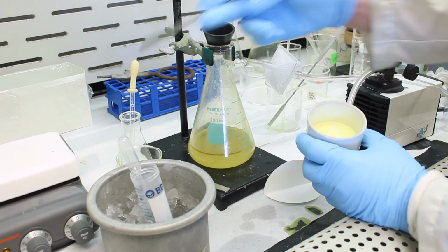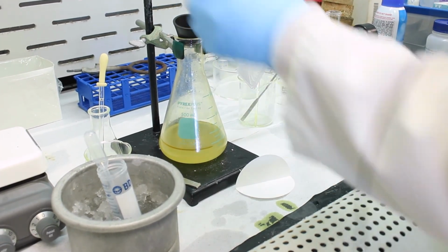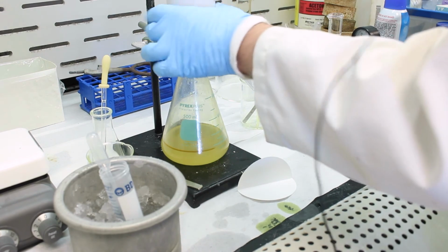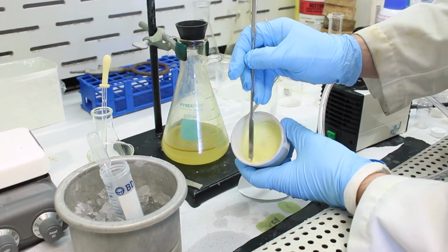Take our spatula here. We wipe it on a paper towel, clean it a little bit. Okay, take out the boiling chips.